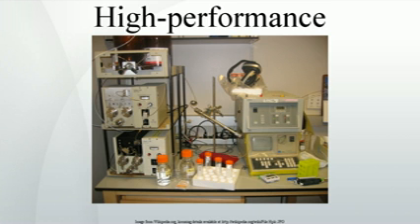The void volume is used as a correction factor. Efficiency factor, N, practically measures how sharp component peaks on the chromatogram are, as a ratio of the component peak's area, retention time relative to the width of the peaks at their widest point, at the baseline. Peaks that are tall, sharp, and relatively narrow indicate that the separation method efficiently removed a component from a mixture. High efficiency. Efficiency is very dependent upon the HPLC column and the HPLC method used. Efficiency factor is synonymous with plate number, and the number of theoretical plates.